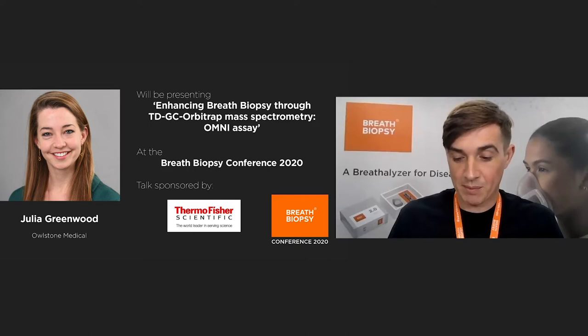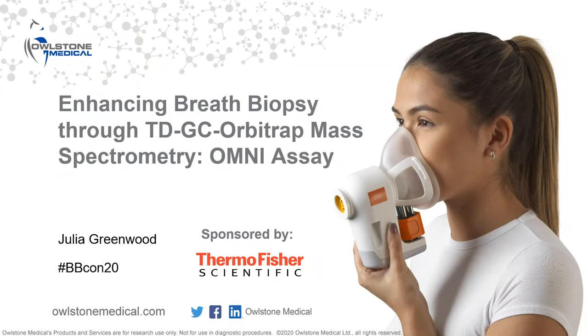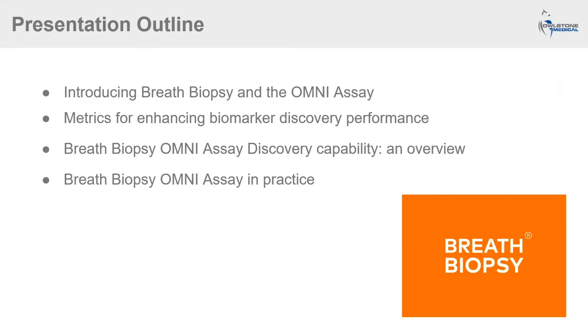This presentation is on Enhancing Breath Biopsy Through TDGC Orbitrap Mass Spectrometry. I'm going to introduce breath biopsy and the Omni Assay and discuss metrics for understanding and enhancing our biomarker discovery performance. I'll give an overview of the Omni Assay discovery capability and also point towards examples of the Omni Assay in practice.